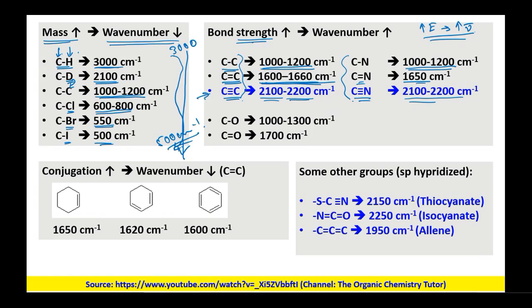So if you look over here, single bond stretchings are at similar levels, whether it is carbon or nitrogen. In these cases, carbon and nitrogen will show CC stretching or CN stretching, depending upon what kind of hybridization is there, we will be getting the same thing.